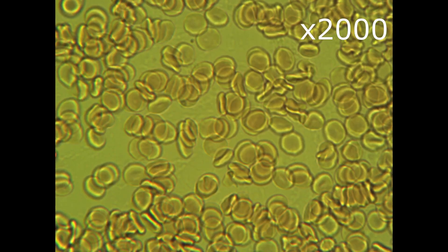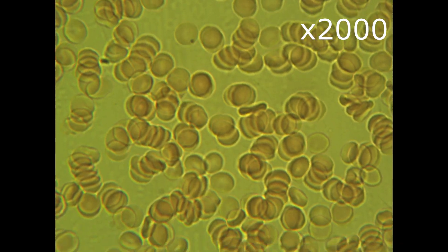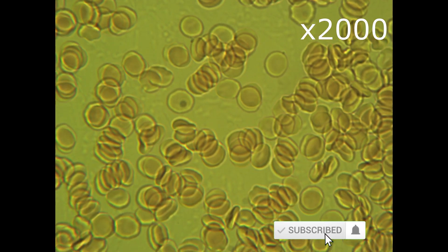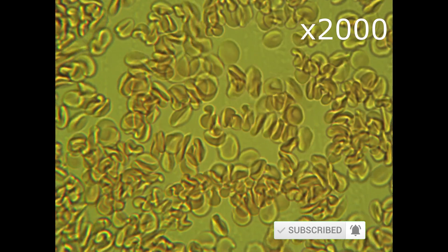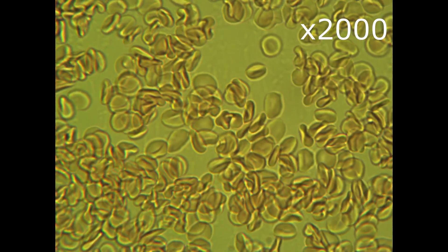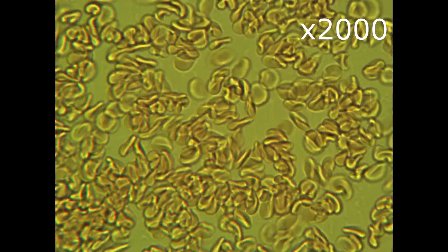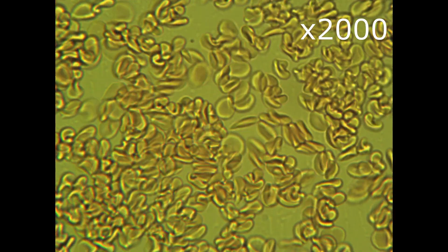Now 2000 times. Let's see the real size of the chains. At first glance they are not that long and they are not gluing to each other. The flow looks good today. Erythrocytes are elastic and move well. It is also noticeable that when erythrocytes hit each other the chains break into individual erythrocytes.